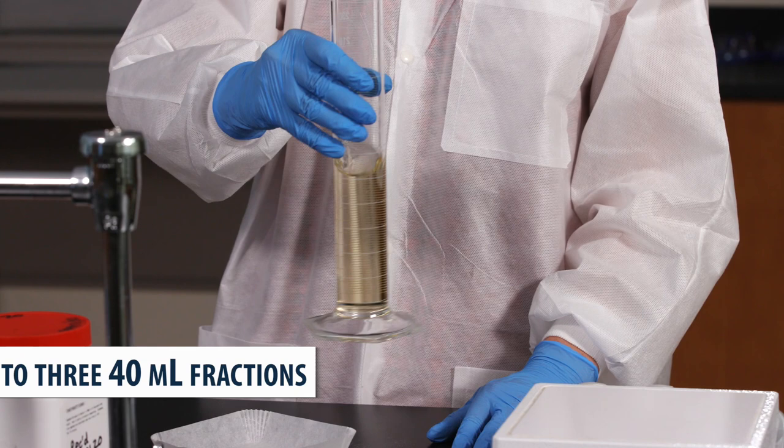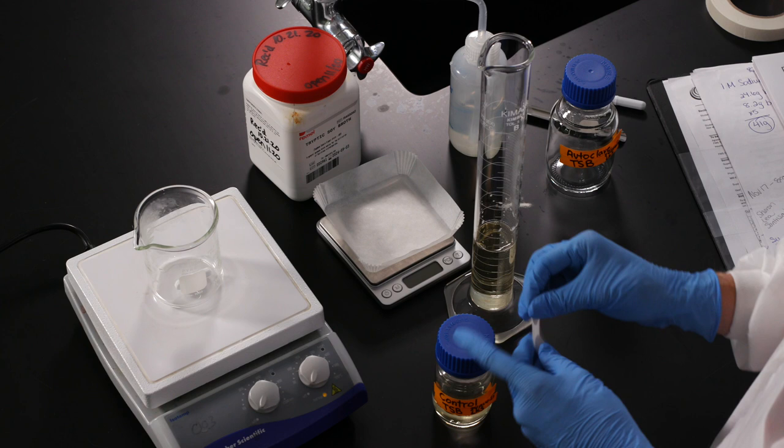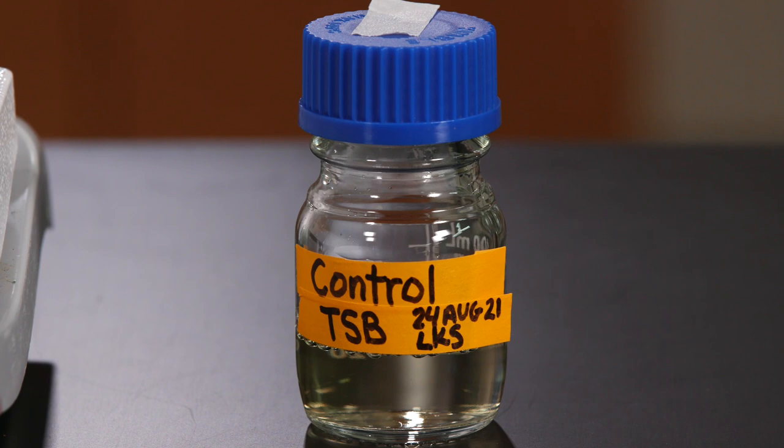Swirl the solution and divide it into three 40 ml fractions. Pour 40 ml of the broth into one bottle, cap it, and place a piece of autoclave tape over it. This is our control.